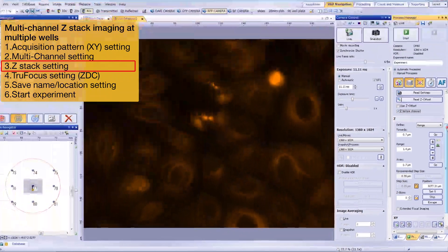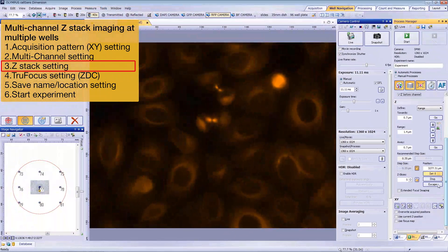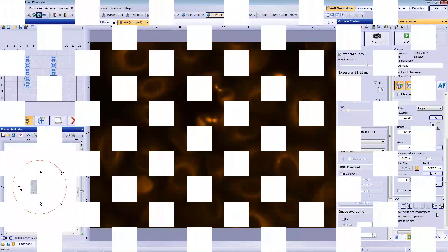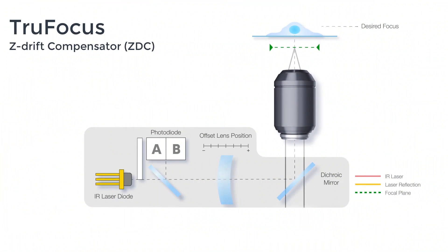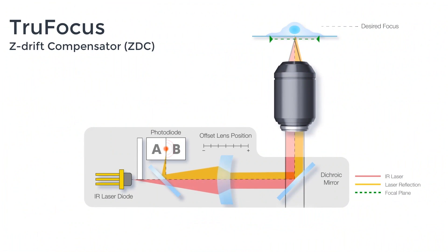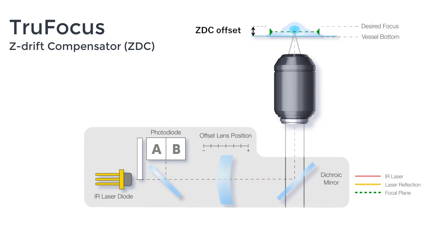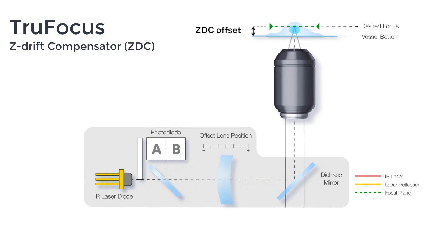Now that the Z-Stack range is registered, let's register the center of the Z-Stack. You should choose the best focus position, which differs depending on the XY position. Because it's difficult to register the focus for all positions, we recommend using a TrueFocus Z-Drift Compensator. The TrueFocus hardware-based autofocus system keeps the sample in sharp focus faster and with less damage to your cells than software-based autofocus. It detects the vessel bottom by emitting an infrared laser and detecting its reflection, then moves the objective lens to compensate for any Z-Drift, keeping your sample in focus.